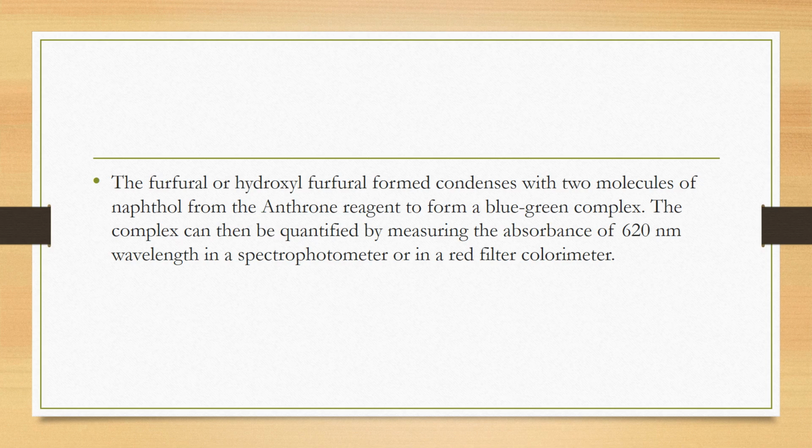Okay, so these spectrophotometers can quantify or detect the concentration of these carbohydrates in each sample. By what? By measuring the absorbance of light at 620 nanometer wavelength in a spectrophotometer or in a red filter colorimeter.